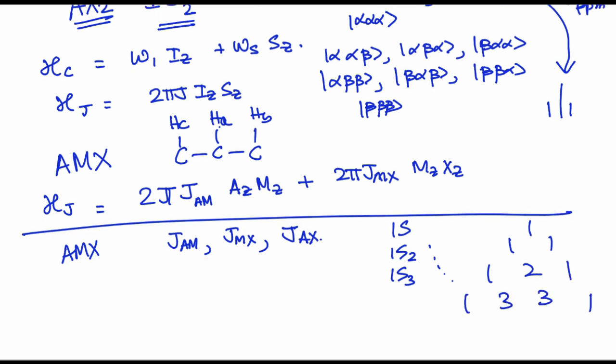Before I finish up the entire discussion on scalar coupling, I'll also give a little bit of intuition how scalar coupling is useful. Similar to the fact that the electronic environment can be deduced from the chemical shift that we measure, the scalar coupling would help you in a way where, let's say you are having two atoms, HA and HB, that are interacting through three bonds.